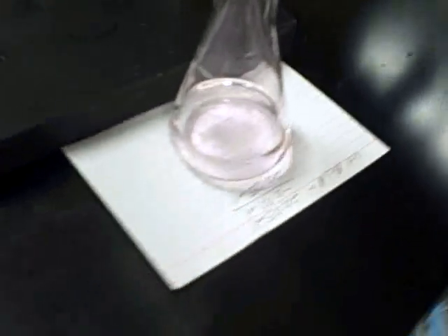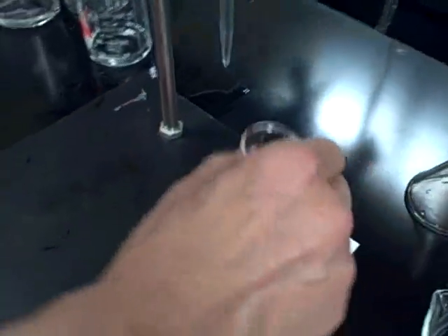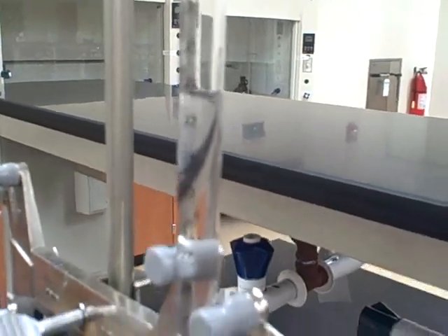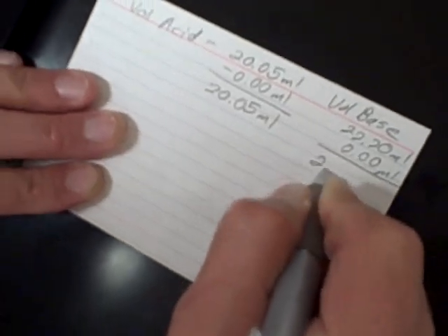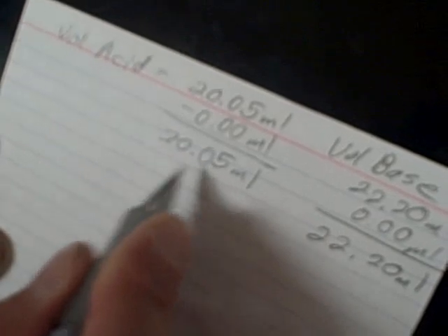So that's the endpoint. I can read the volume here — it looks like 22.20. The volume of the base is 22.20 milliliters, starting from zero. Knowing the concentration of the base and the volume, I can calculate what the concentration of the acid should be.